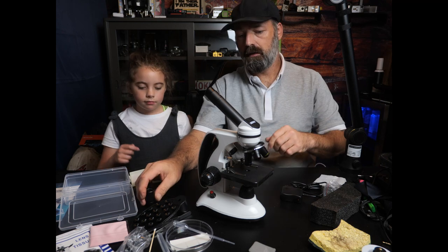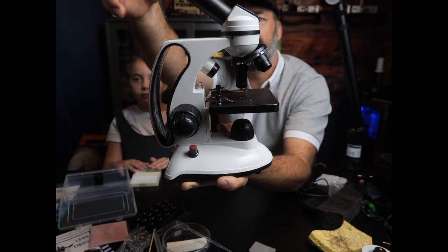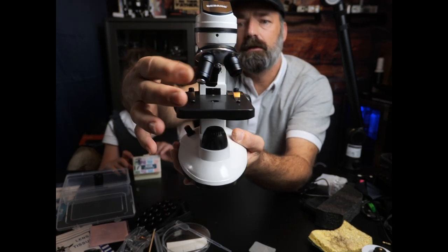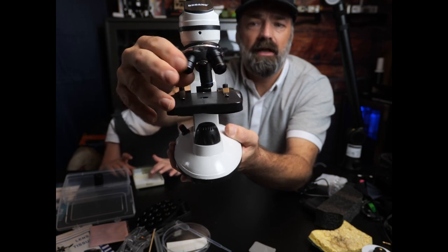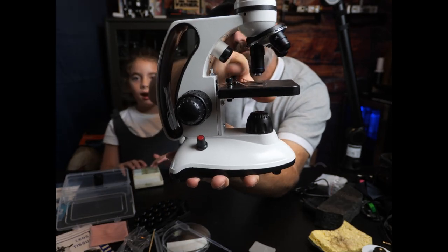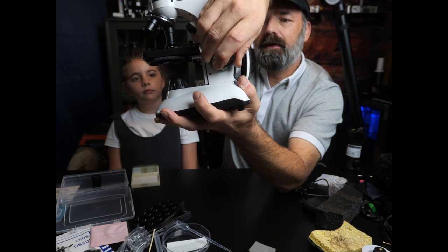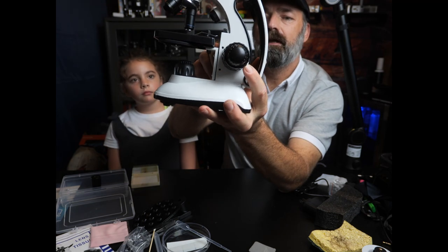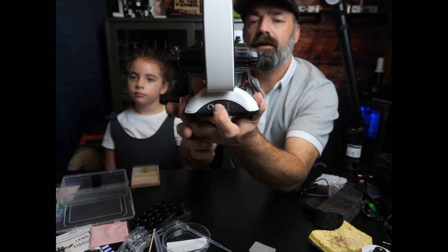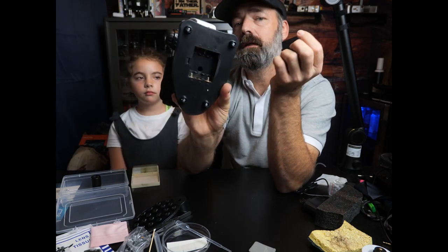Here's a closer view of the microscope itself. You can see where your eyepieces go. These are your different magnifiers — a 10x, a 4x, and a 40x. It has little slide holders. You have a top-view LED and a bottom-view LED for lighting from below. You have a focus knob on the side — the big knob is your fast focus and the small knob is for fine-tuning. On the back you plug in your power source and control your top and bottom LEDs.